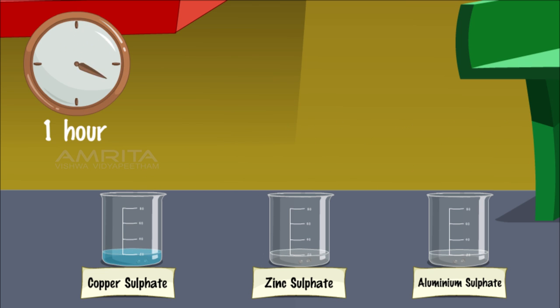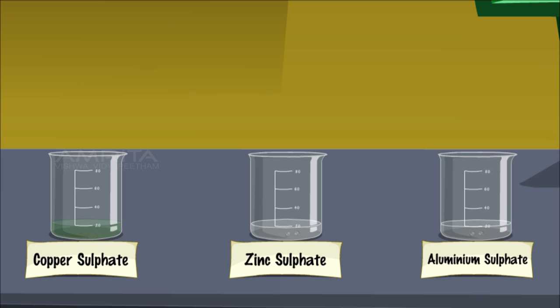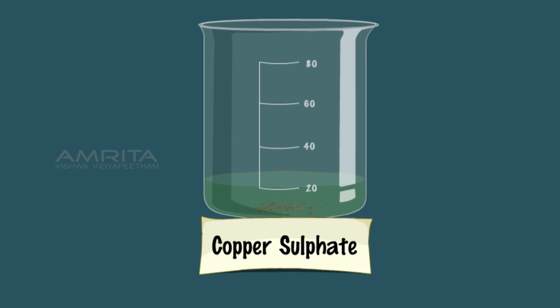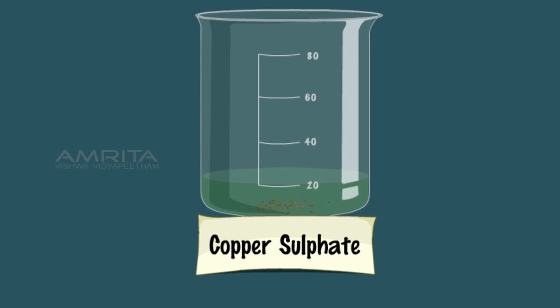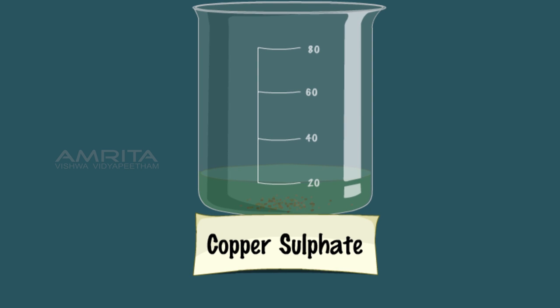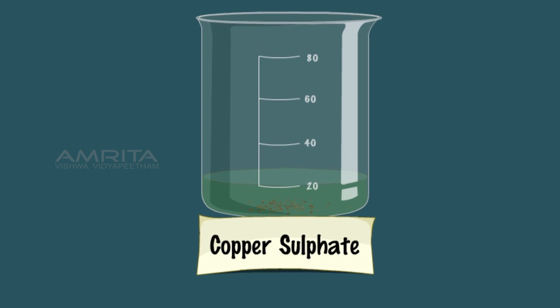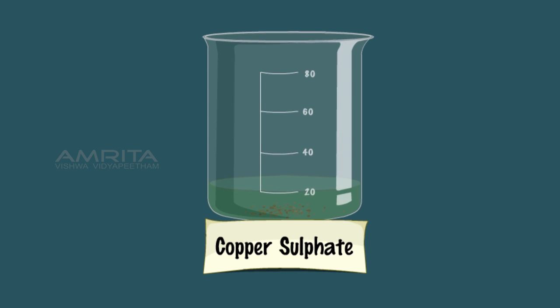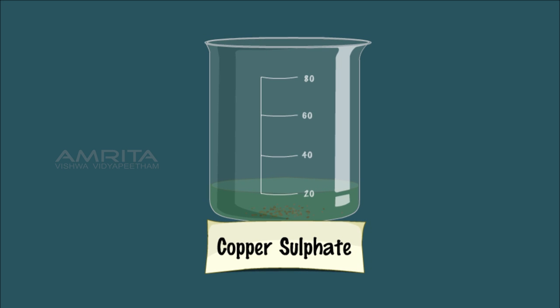Leave the beaker undisturbed for an hour and note the changes in colour of the solutions and the appearance of the metal. In the case of copper sulphate solution, the blue colour changes to light green and red-brown particles of copper settle down at the bottom of the beaker. This indicates that Fe is more reactive than Cu and it can displace Cu from CuSO4 solution and form a light green coloured FeSO4 solution.